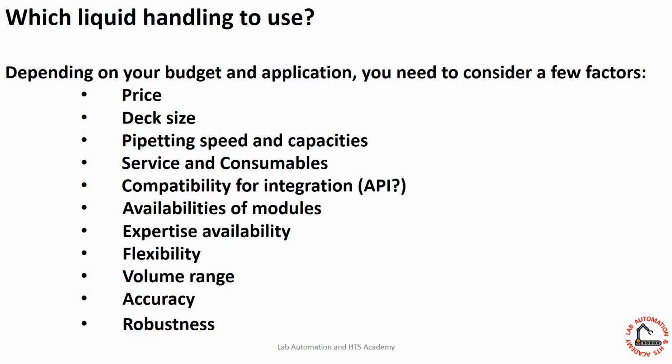Have it in mind. Who is going to run this robot? And do you want to spend money and hire a new person to do it, or is one of your wet lab scientists going to go to training to learn how to use it? Those sorts of questions become very important down the road.